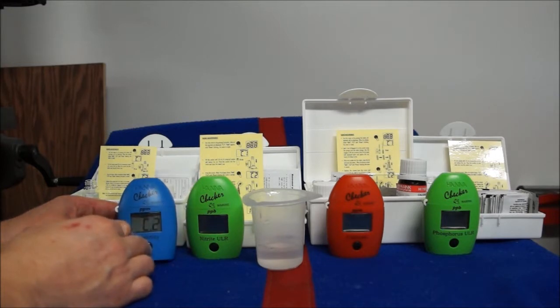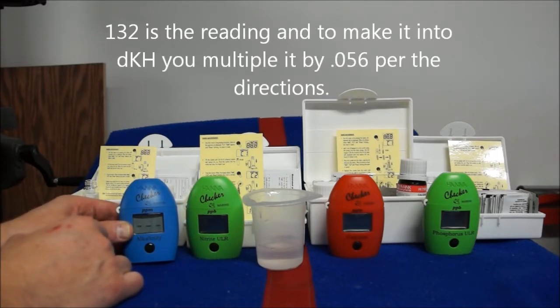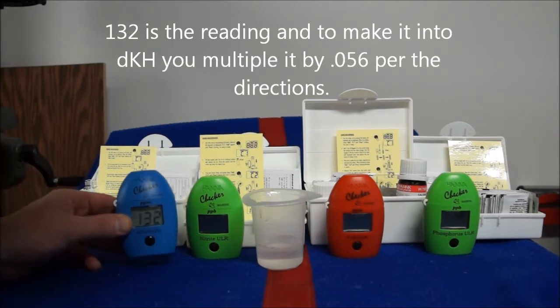Very simple test, takes about two minutes to run. All these tests are simple — I can do all of this in about 10 minutes once a week. I highly recommend it. The reason I like these testers versus other companies is I don't have to compare a color to a color chart to figure out what it is. I like the digital readout.